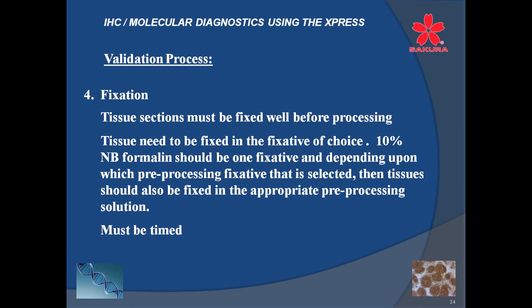And I know this is still an ongoing issue in most places, and that's why guidelines have been set up, and certainly with like the CAP ASCO guidelines for breast, that they've been set up to give us some guidelines for proper fixation. There's a lot of variables there. There are a lot of standardization ideas there to get done, and it's a matter of you selecting some, working with them, learning the idiosyncrasies about them, and then putting them in place, and everybody looking at slides. It shouldn't just be pathologists. It should be pathologists and histotechs, the people doing the work, so they understand and know the pitfalls and the variables that are encountered.